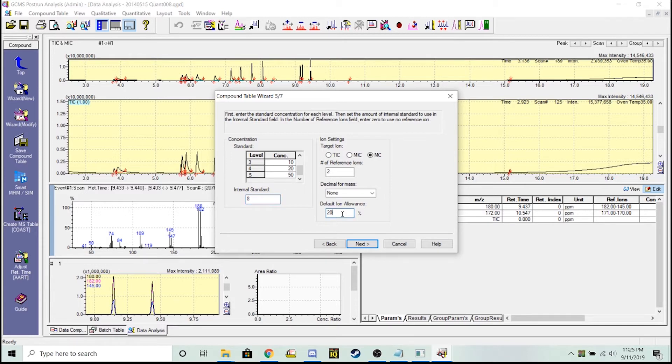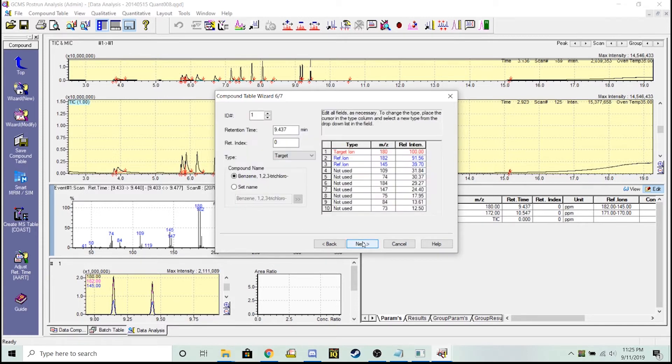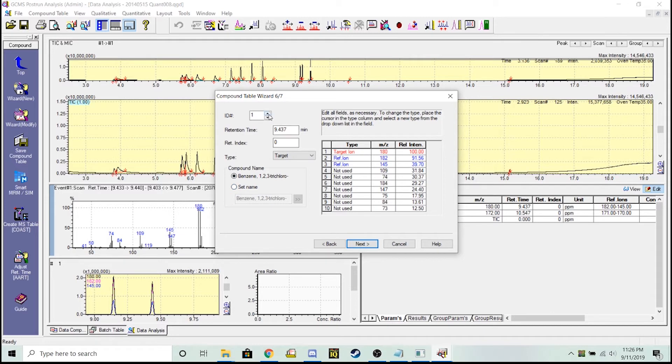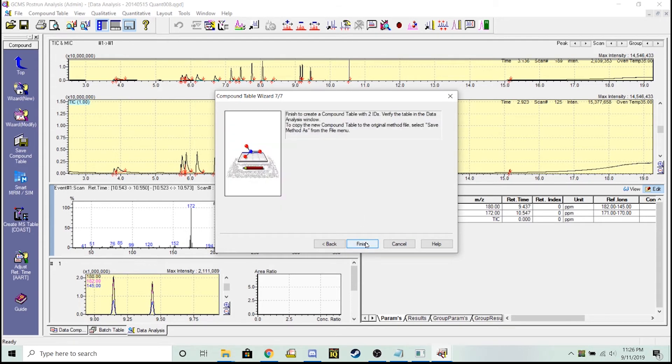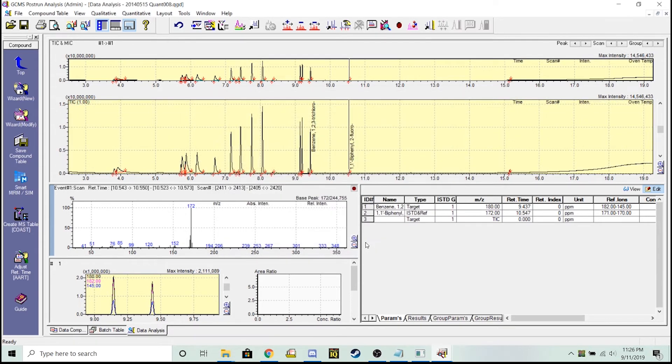We also ended up changing this default ion allowance to 20. Now I'm going to select which of these chemicals or targets. My 1,2,3 trichloro is a target and then I go up one - my two fluorobiphenyl is going to be my reference to calculate against. Let's go ahead and hit next and then finish.